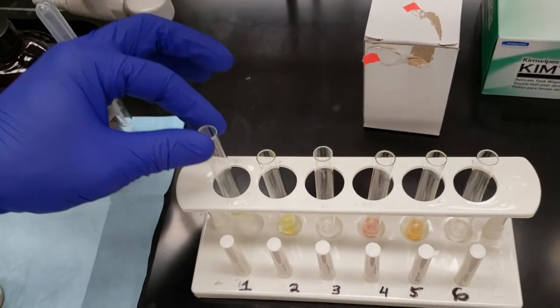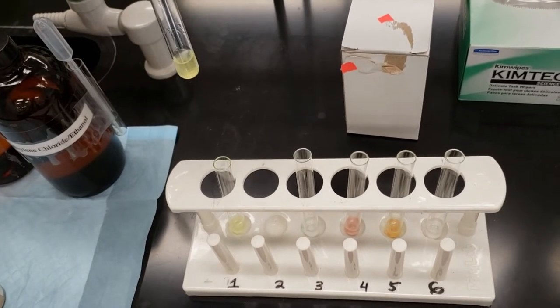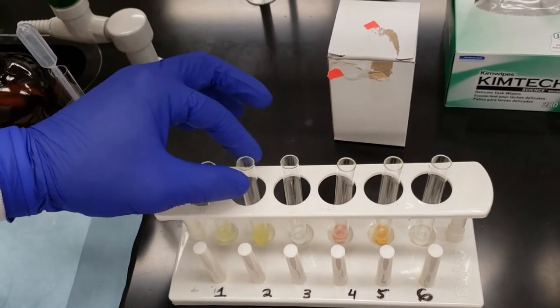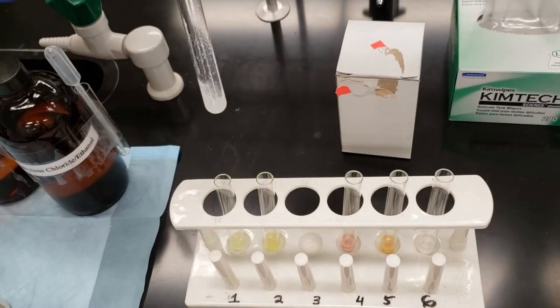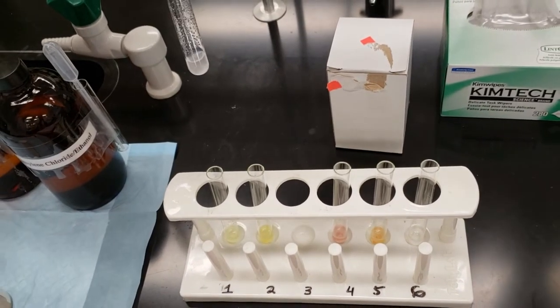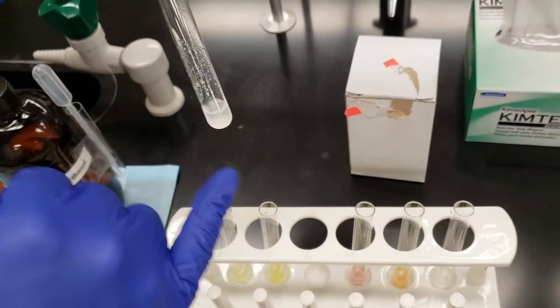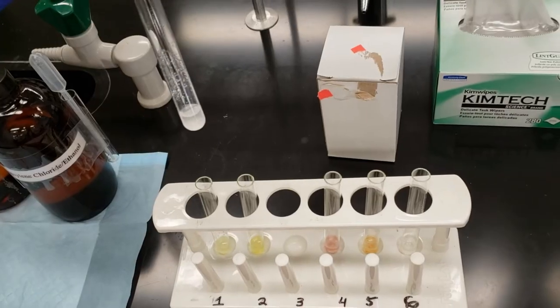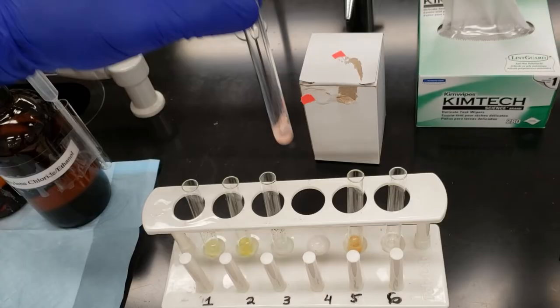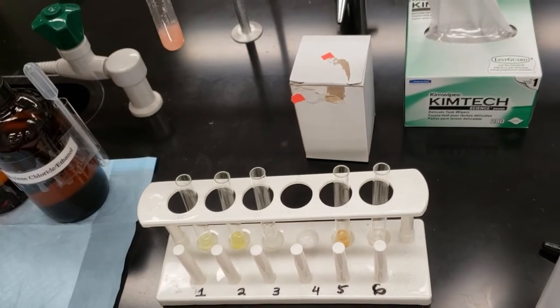So a pale yellow for number one. We've got a brighter sort of canary yellow for number two. A white translucent mixture for number three. Again, doesn't matter, we can see grains of our powder here, but we have enough dissolved that we'll be able to spot it very easily. These will be fairly concentrated solutions for TLC spotting, which is very good. Means we'll have to spot a little bit less than we might if they were more dilute.